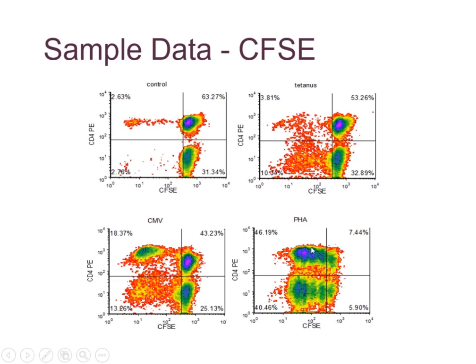So you have the cells that haven't divided here, the next generation, and the next, and the next, and then next. You can just barely make out that one. So they're not synchronized, but kind of march off in cohorts, giving those characteristic peaks and allowing you to measure how far out each generation shifts.